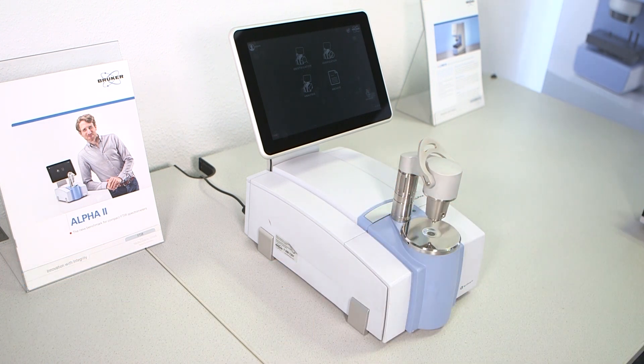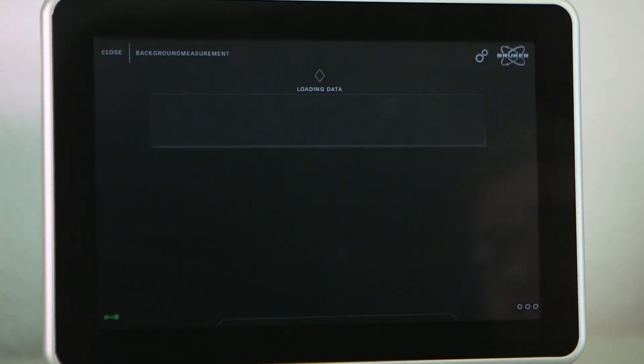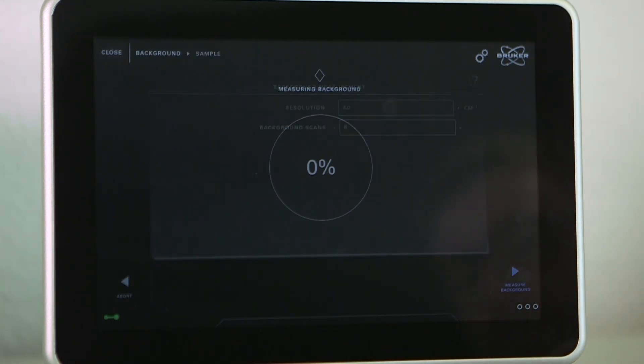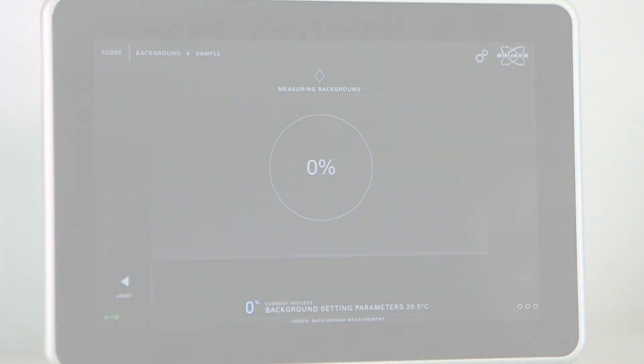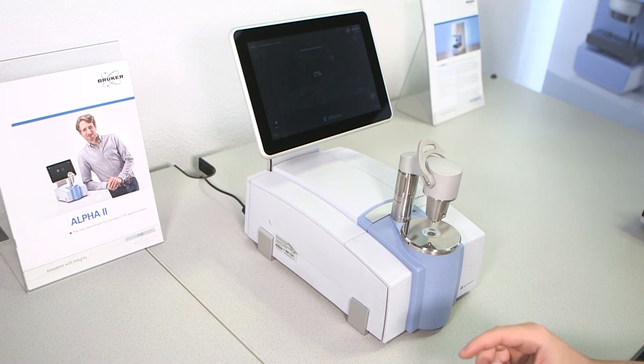The start of any FTIR analysis is a background measurement. Before measuring, make sure the crystal is clean and use rubbing alcohol and soft tissues if cleaning is necessary.